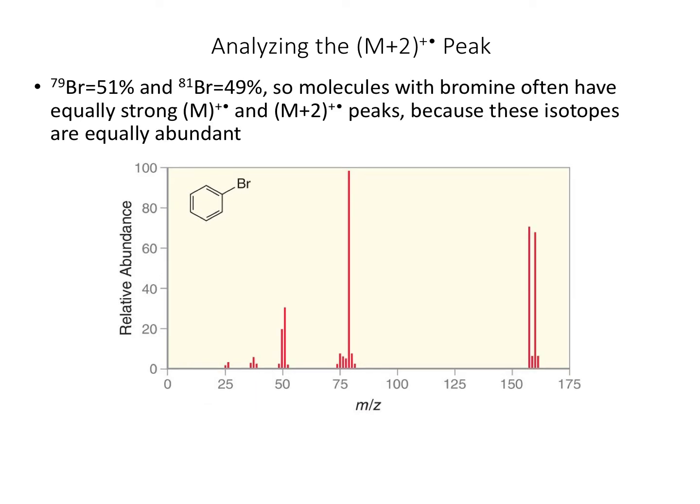Alright, another halogen that we can recognize based on the M+2 peak is bromine. And so bromine also has two naturally occurring, relatively abundant isotopes, bromine-79 and bromine-81. And their difference in mass is exactly 2 mass units. And so it also gives rise to an M+2 peak.